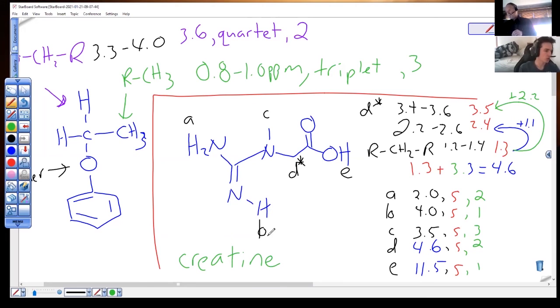And then C would be the methyl, a height of 3 compared to this, which is a height of 2, compared to this, which is a height of 1. There's all 3 H's on this carbon. So heights have nothing to do with neighbors. No, that's a totally different story. The easiest question to answer is this third question. You should always do that first. Just count up the H's, and you just write it down.